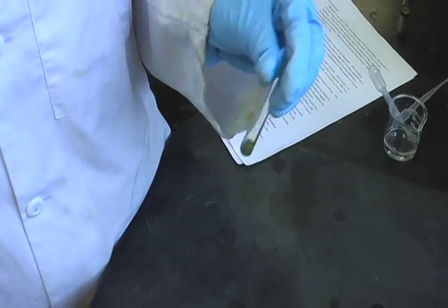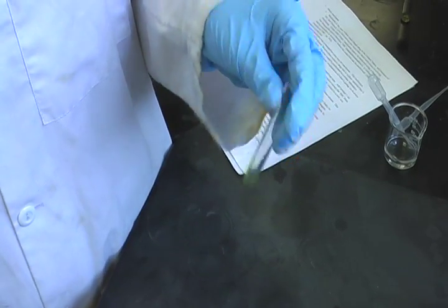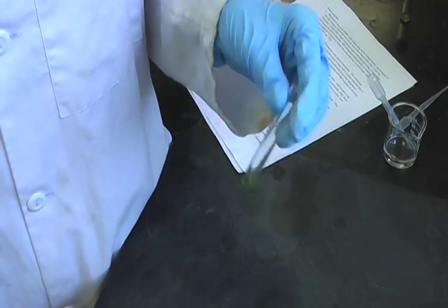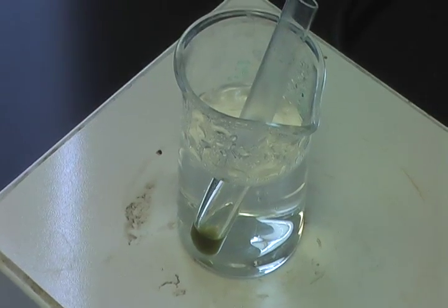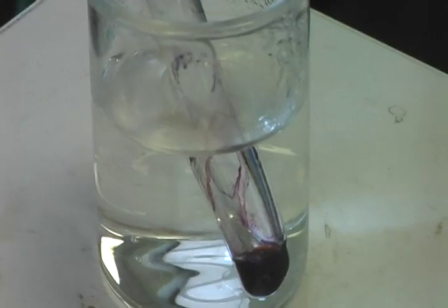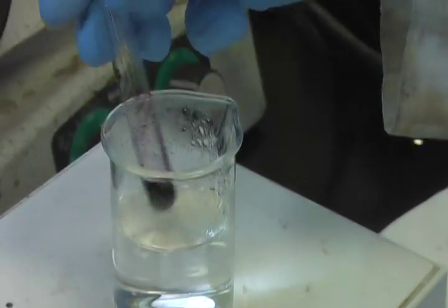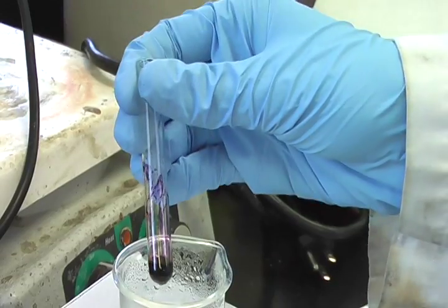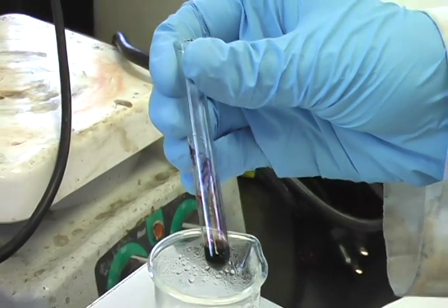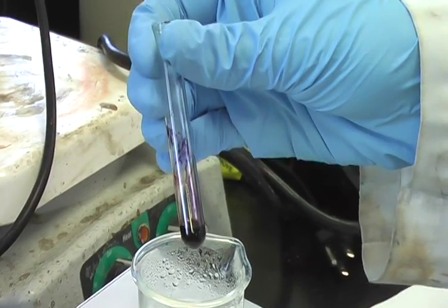Now, the test tube is shaken for 30 seconds and placed in a hot water bath for two to four minutes. After heating for around two minutes, a purple color is observed, which is due to the completion of the condensation reaction, which forms a chromophore.